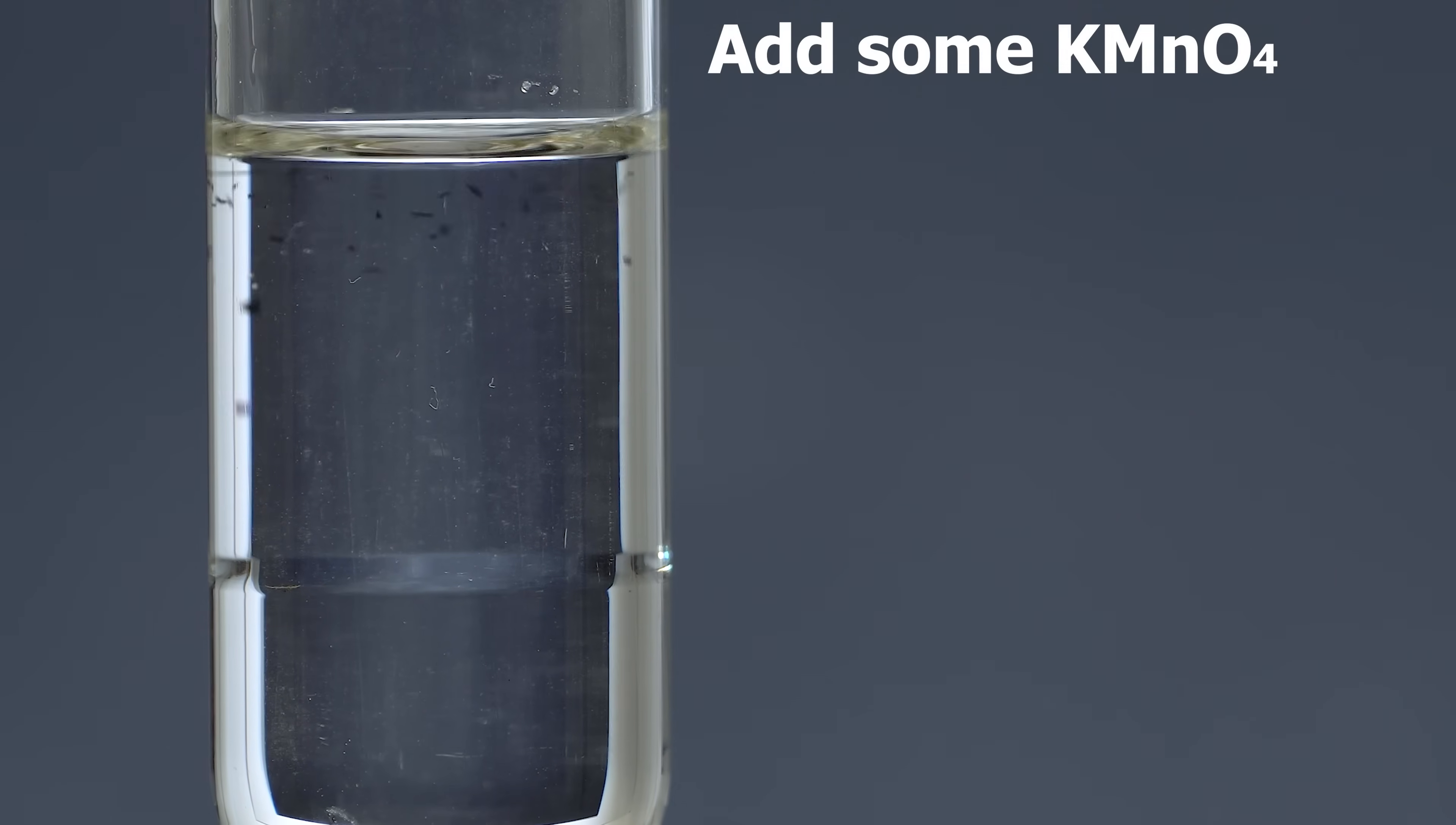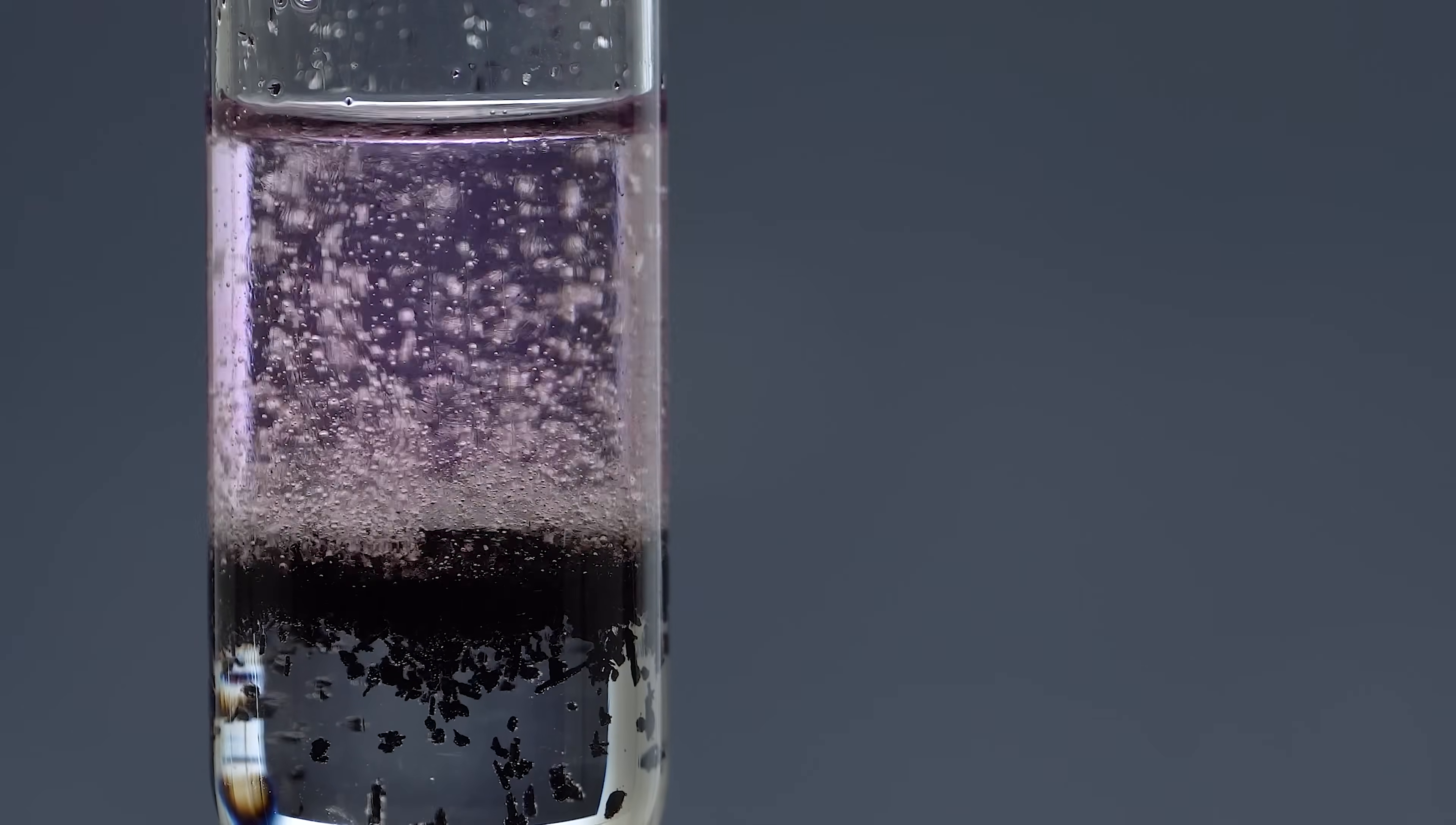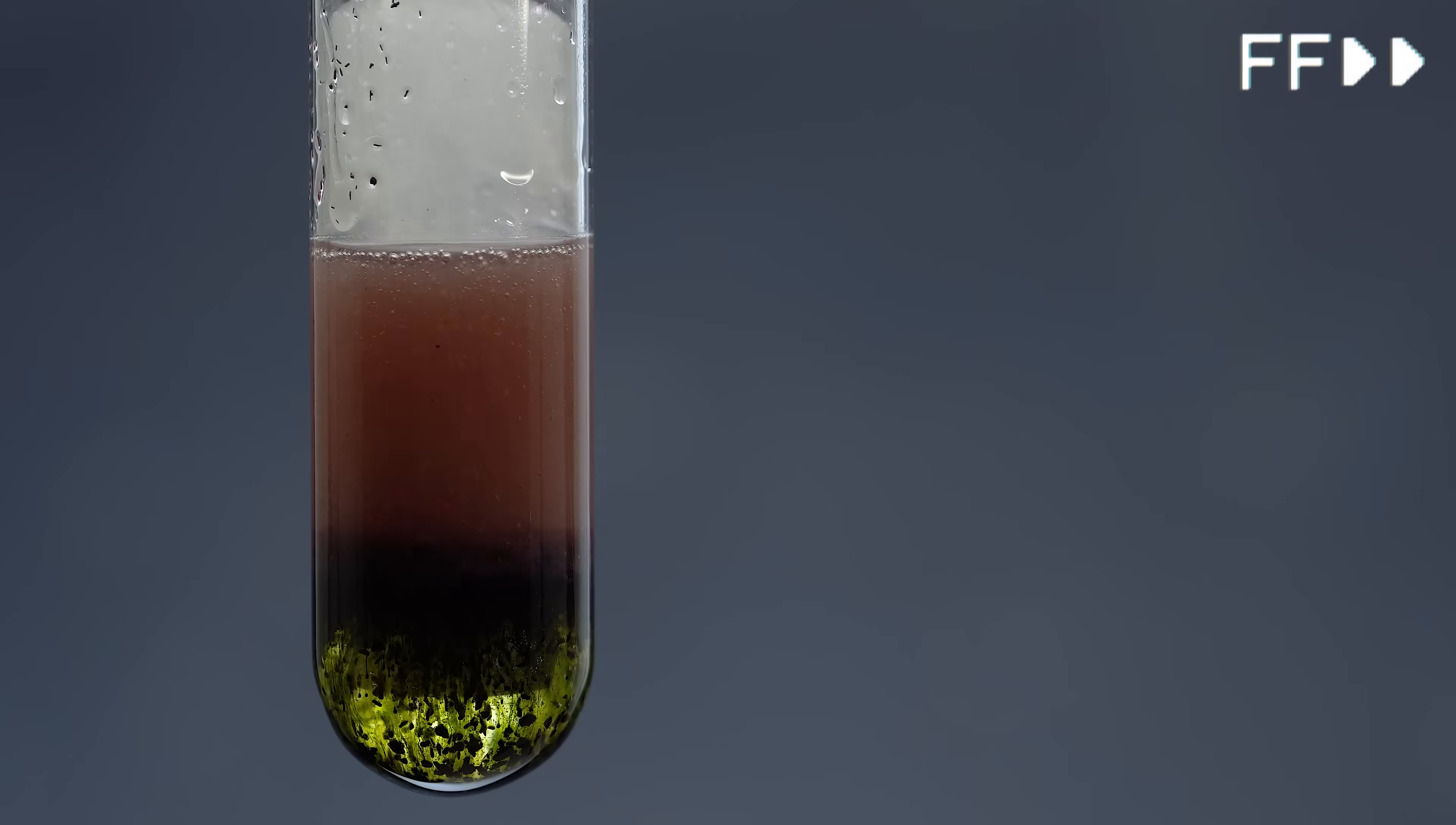We then add some potassium permanganate into the test tube, and after a while the reaction starts to make a gradually louder crackling sound that resembles thunder.